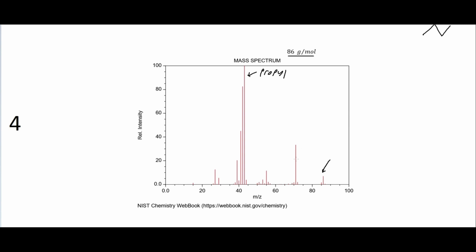So we have here a peak at 71. So at 71, where this was 43 right here. So the 71, remember, is a pentyl group. And we have this peak right here, which is at, so we can do 40, 45, 50, 55. So we have one at 55 right there. And so we have one then right here, which looks like it's at about 32.